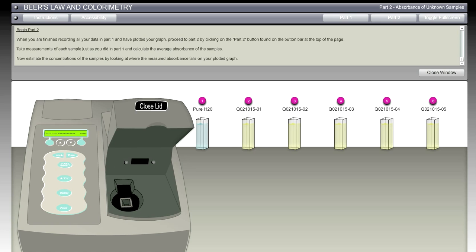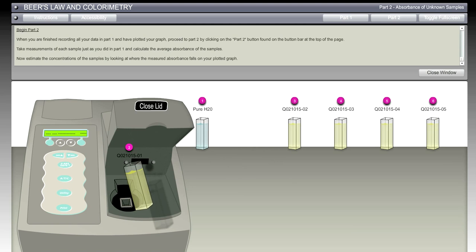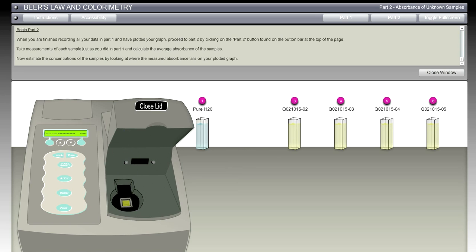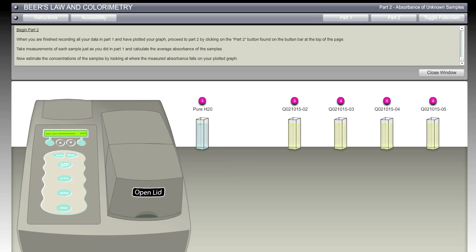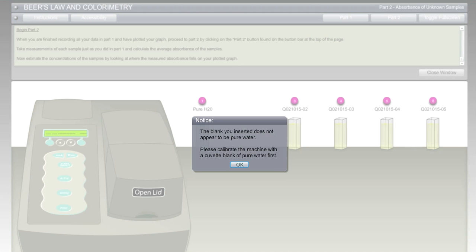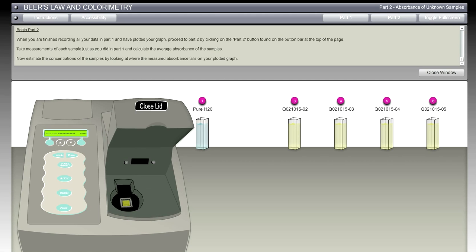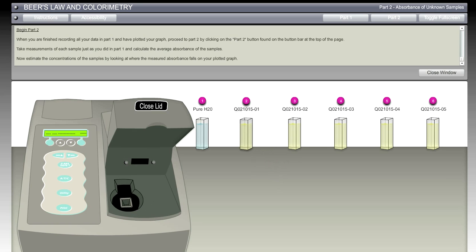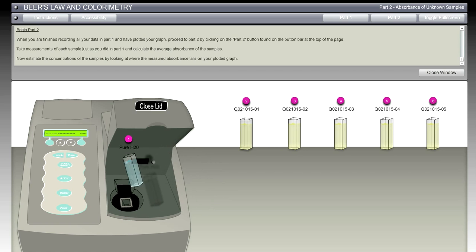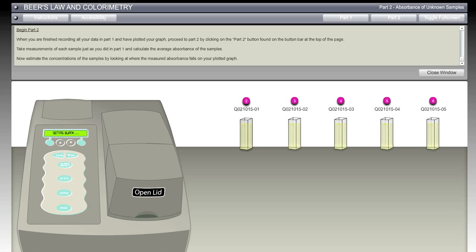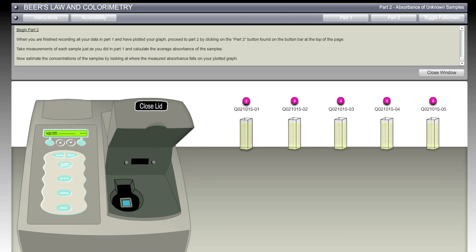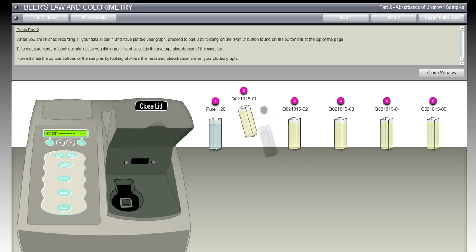I'm going to open the lid and take a reading of the first sample, as some students would do. But what happens now is when I try to click on the absorbance to calibrate - the blank you inserted does not appear to be pure water. Please calibrate the machine first with a cuvette of pure water. So we're going to do that, just like we had in Part 1. We do need to recalibrate the machine. This is a new experiment, so we treat each one individually in terms of calibration. We're going to close the lid, recalibrate that, then take the blank of H2O out. It's now ready, it's been calibrated.